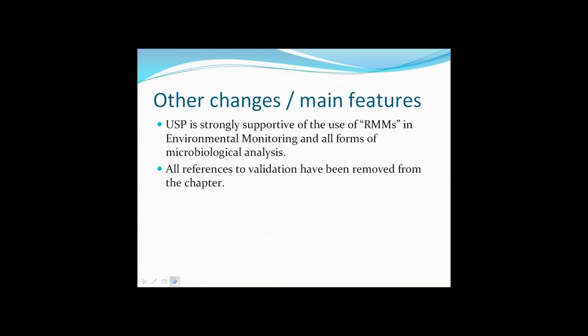And for those who want to know more about that, then I'd recommend that you have a look at Dr. Michael Miller's website, and there's some useful advice on there about this technology. However, aside from that, non-traditional rapid methods, all references to the validation of environmental monitoring methods have been removed from the chapter, and whether they appear at a later date remains to be seen.